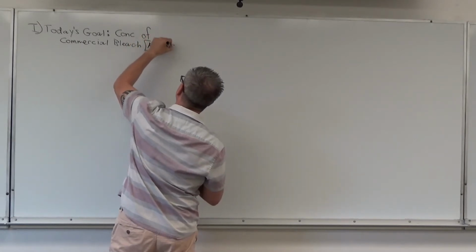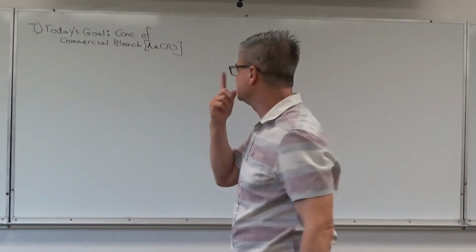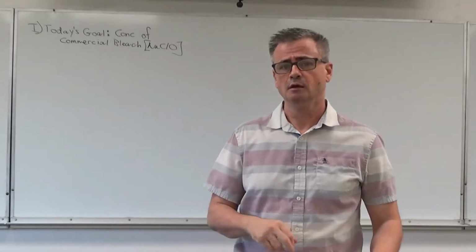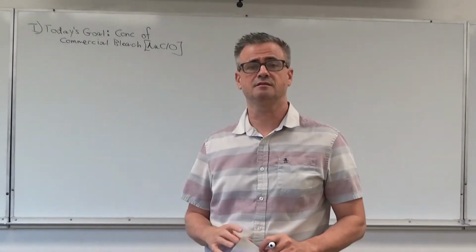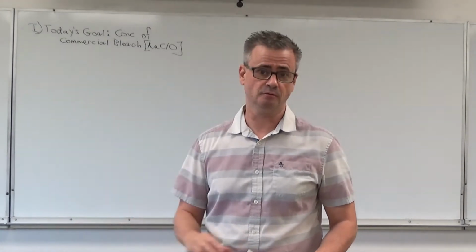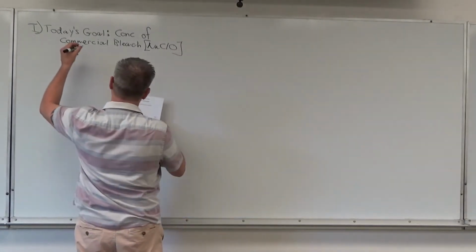Sodium hypochlorite. Brackets around a chemical mean concentration, and usually that means molarity, moles per liter. You need to be in the habit that if you hear the word molarity, you automatically think moles of solute and liters of solution. That just needs to be absolute second nature.